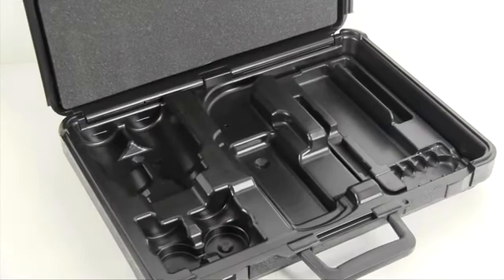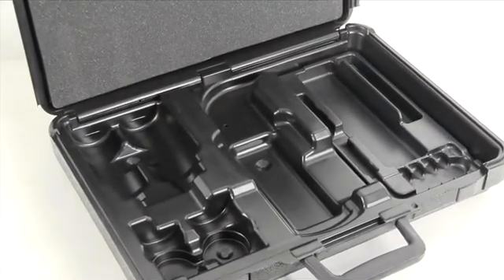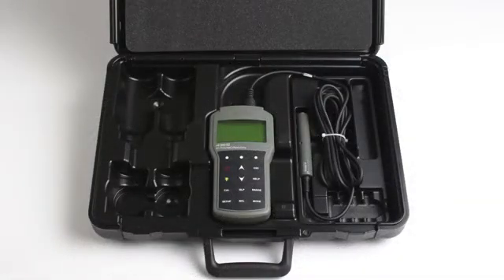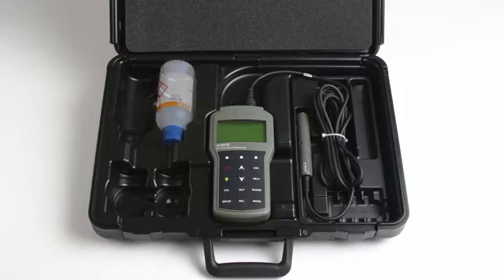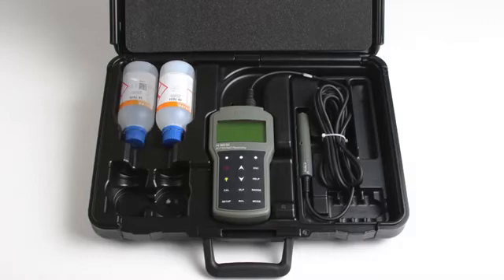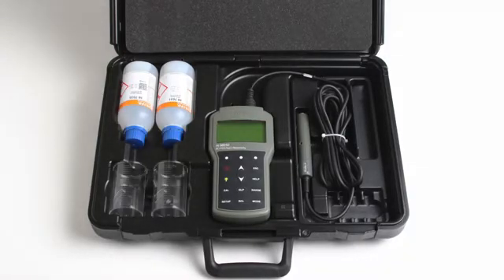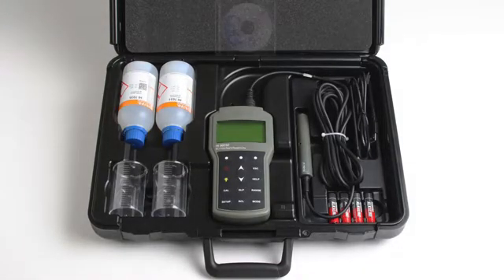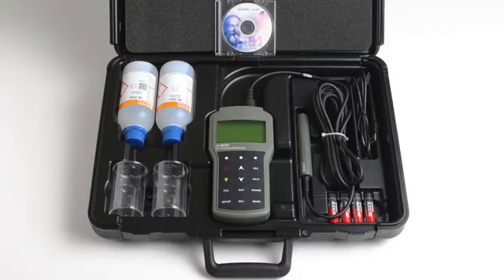The HI-98192 comes packaged in a rugged and heavy-duty carrying case that is thermoformed to secure the necessary components for routine measurements. In each case, along with your meter and probe, the following materials are supplied: one bottle of 1413 microsiemens per centimeter calibration standard, one bottle of 111.8 ms per centimeter calibration standard, two plastic beakers, four AA batteries, one micro USB cable, Windows-compatible PC software, and an instruction manual with quick start guide.